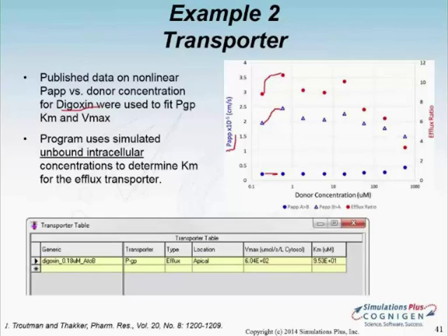Okay, thank you. Another question on slide 40: when we compare the three types of drugs, acidic, neutral, and basic, the lysosomal concentration simulations change as hypothesized, but there is no visible change in the drug concentrations in the cytosol, apical, and basolateral compartments. How could that be explained by mass balance, and was the initial concentration the same for all three drugs? Let me go back there.